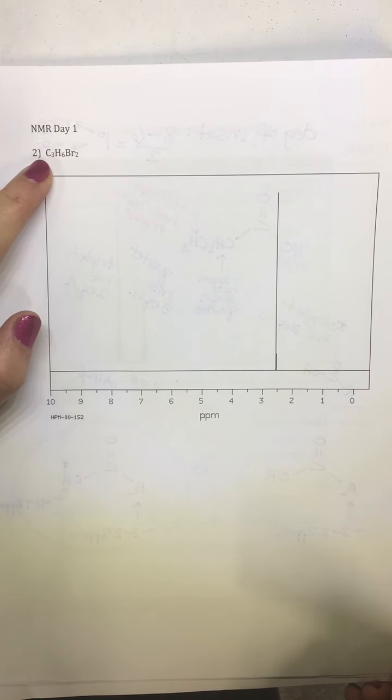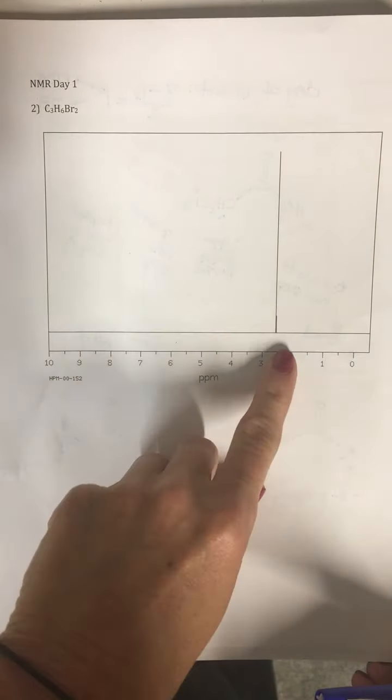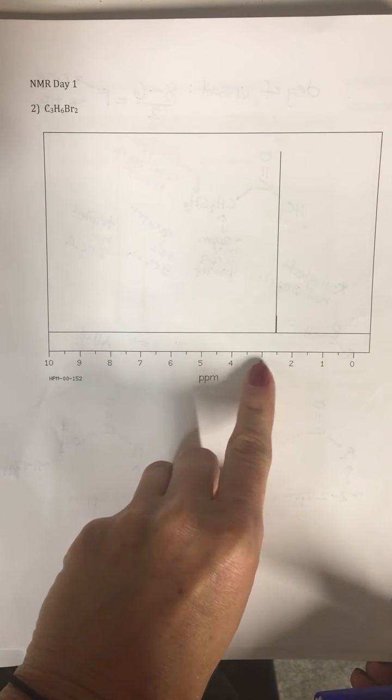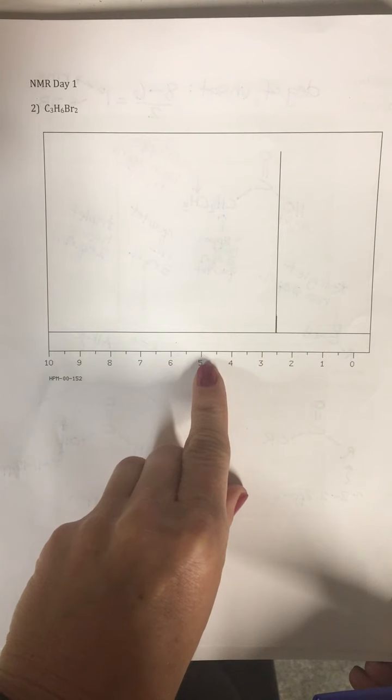Okay, guys, here is our second spectrum that you should have in front of you. Again, we're only working with 3 carbons. And notice this time that we have a couple of bromines in our example there. If you look at your spectrum, there's only one signal. And of course, looking at the chemical shift, we talked again about those halogens being in that 2 to 5 region.